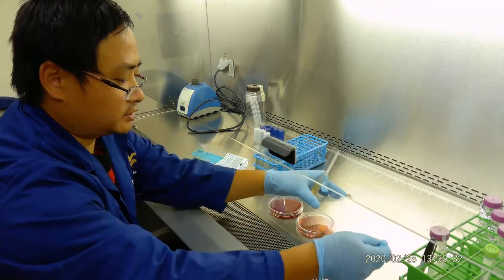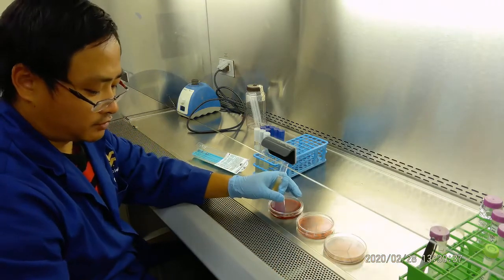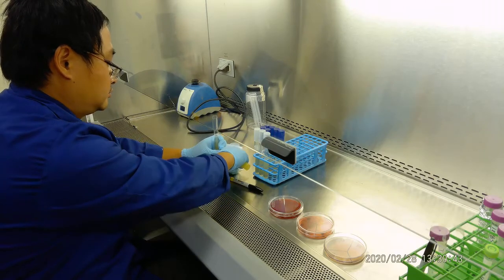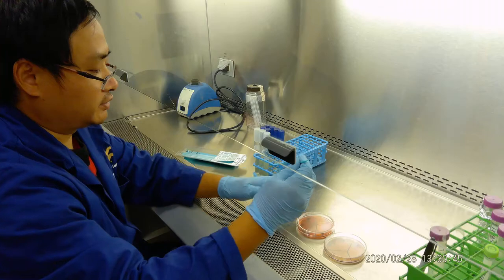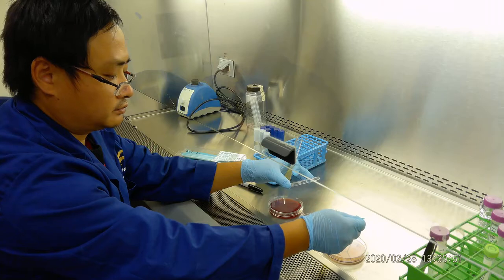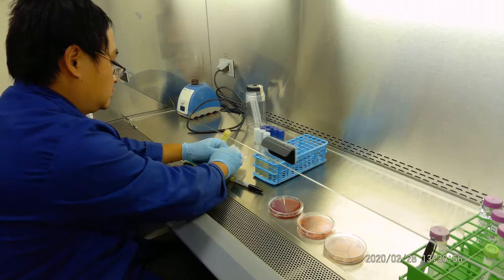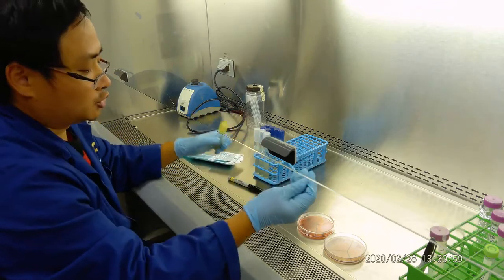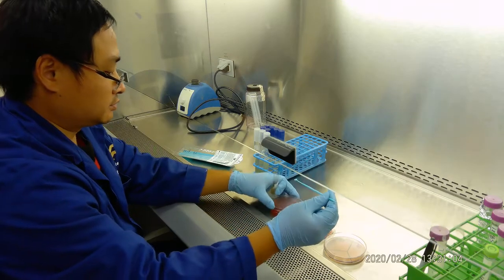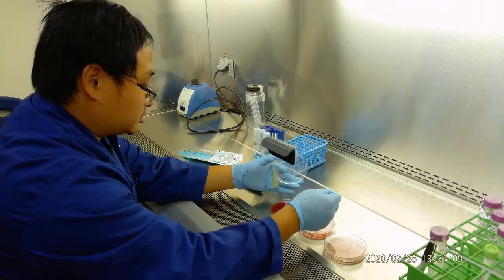So very simple. We do a very easy streak like that. Okay. Then we have to throw them away. Use the second one to do a very simple streak right here like that. You take a picture, and then for you it's just like do a flame. So that will be done. Okay. So Staphylococcus aureus, you have to log this carefully. It will be on this corner. So like that.